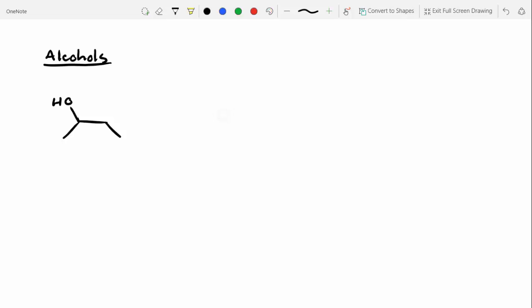So when we do this, we would end up knocking out one of those electrons, meaning we've got an unfulfilled lone pair. We have a single electron on that oxygen. And therefore, this is now a cation. Okay? And then what I'm going to do is I'm going to label my carbons. So what will this carbon be labeled, that red one? Should I label it alpha, beta, gamma? Alpha. So this carbon right here is beta because it's one away from where that alcohol attached.